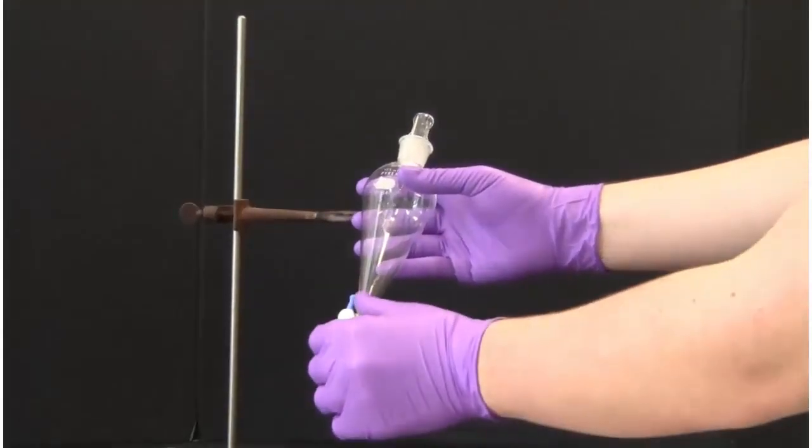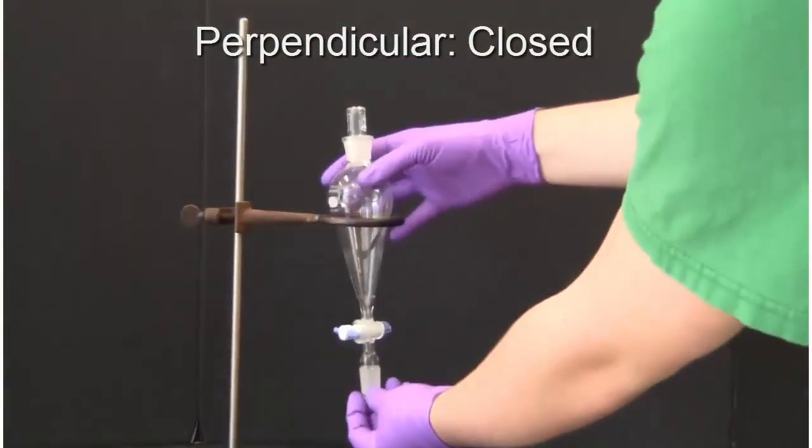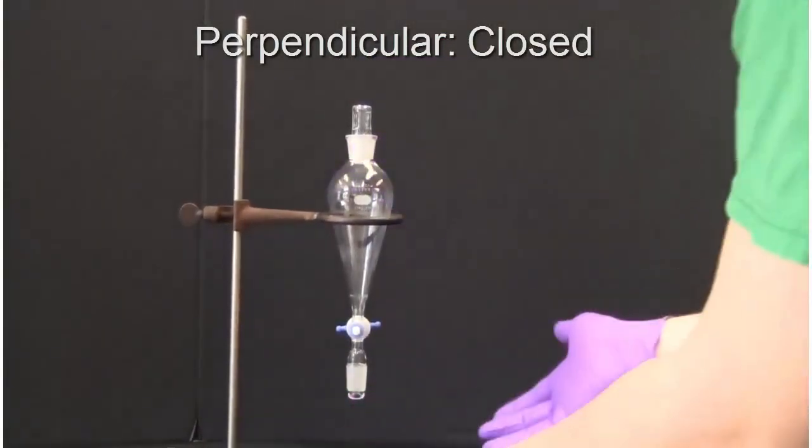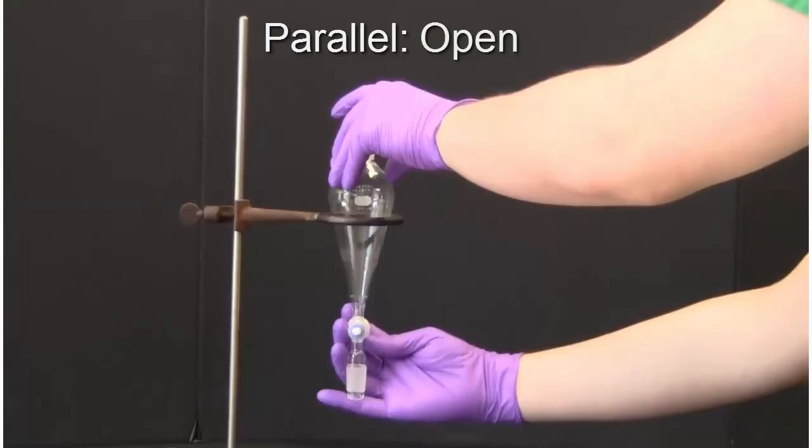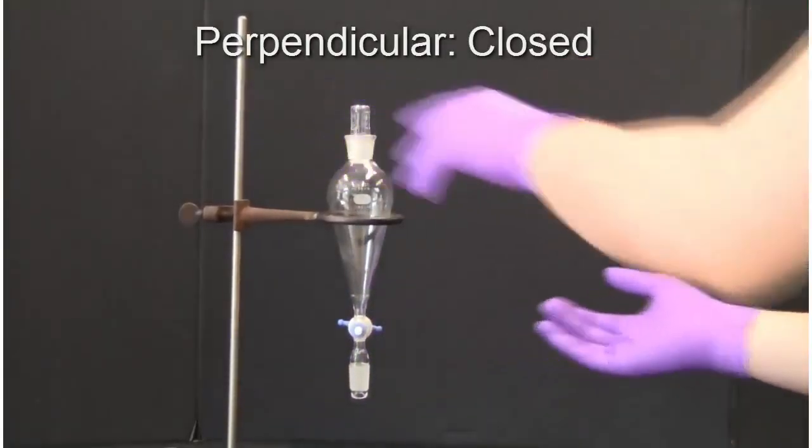The separatory funnel is placed in the iron ring stand with the stopcock at the bottom of the funnel in the closed position. Double check your stopcock before adding liquids to avoid leakage. The stopcock is closed when the valve is perpendicular to the neck.